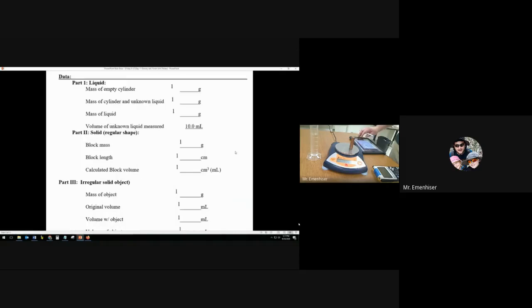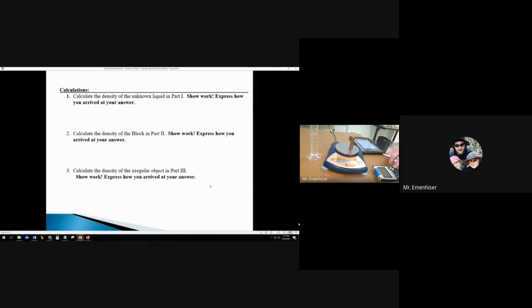Double check. Triple check. All right, don't check no more. Let's keep moving. What are you doing?